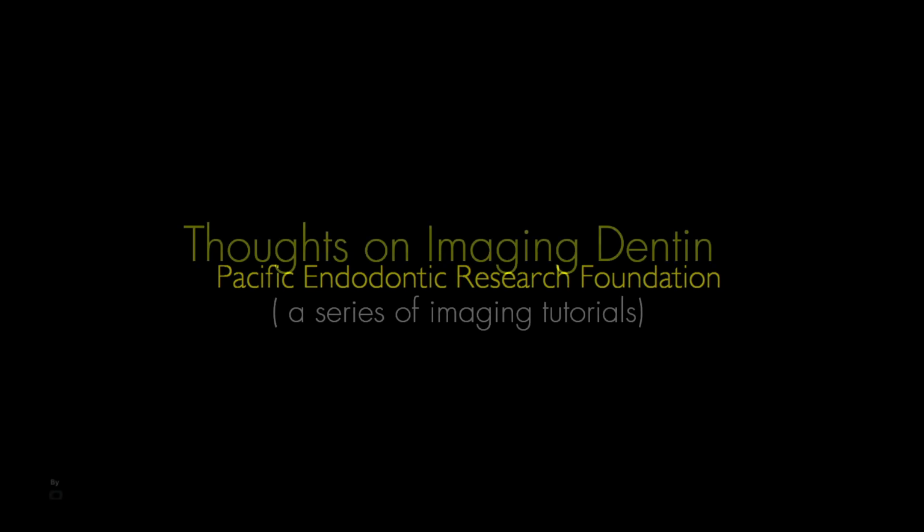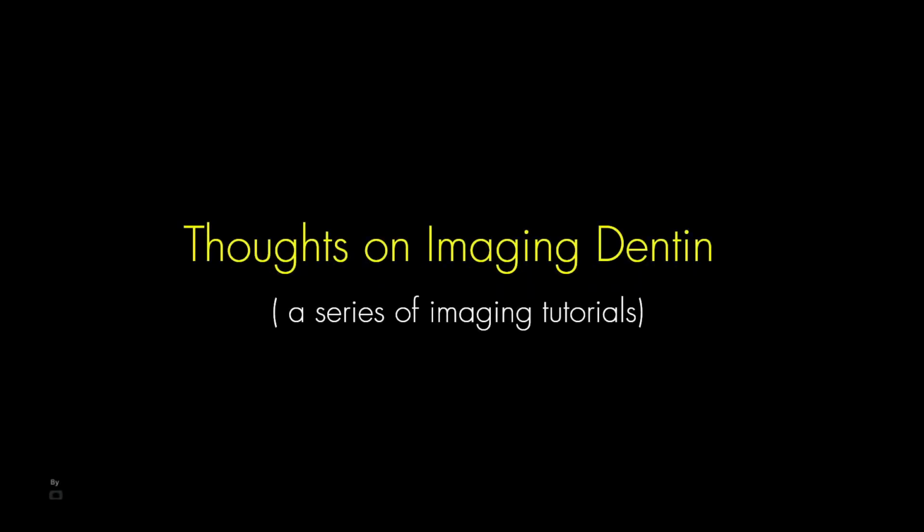On Rick's suggestion, I thought I'd put together a series of tutorials on distinguishing biofilms from decalcifying dentin. So this is the first part in a series of tutorials that hopefully can help you with this question. So let's start with a simple question.